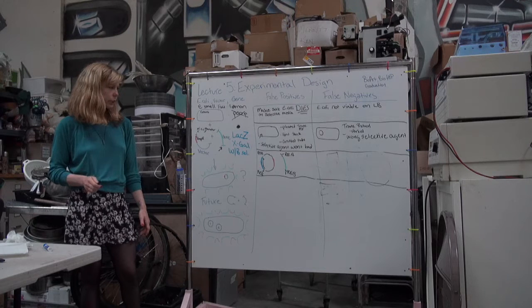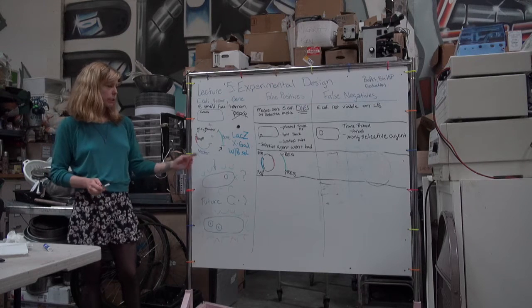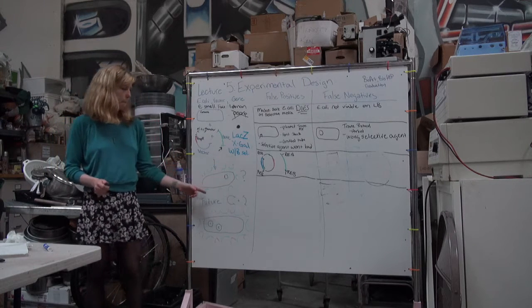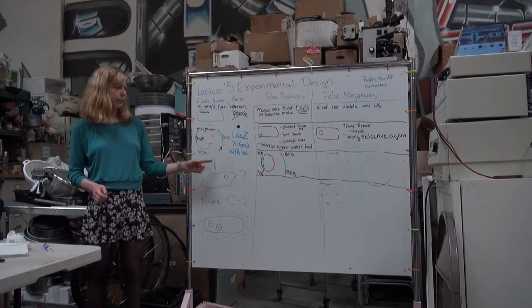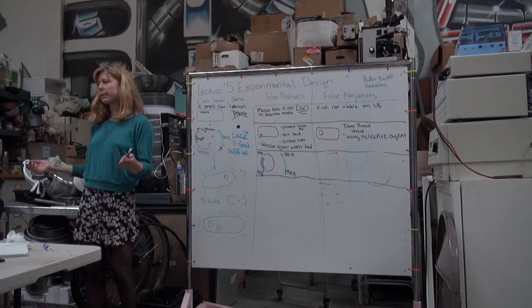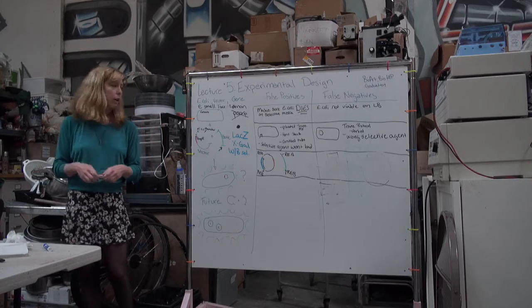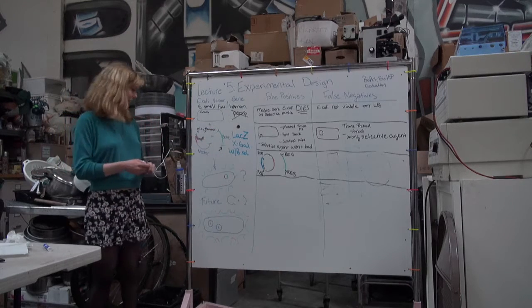All right, cool, we got our gene in. But I don't know if my gene is being made or not, right? One of the ways that we can determine whether the gene is being made is that we add a little tag on the end.